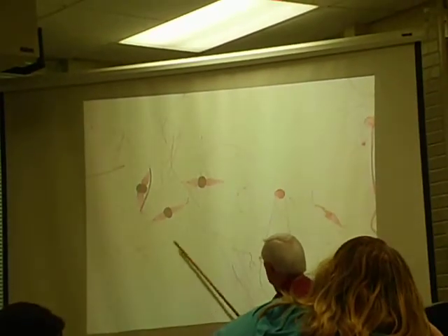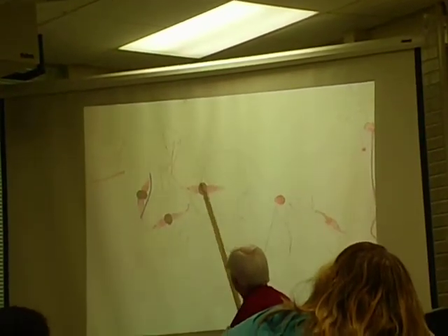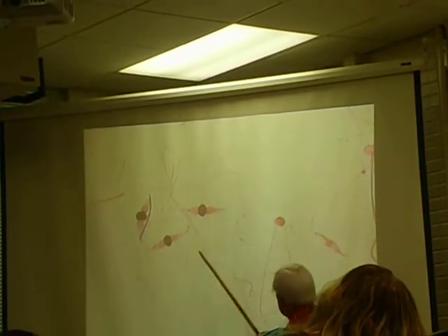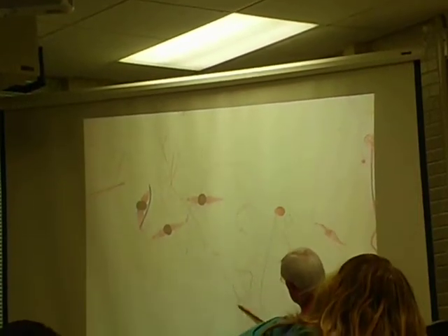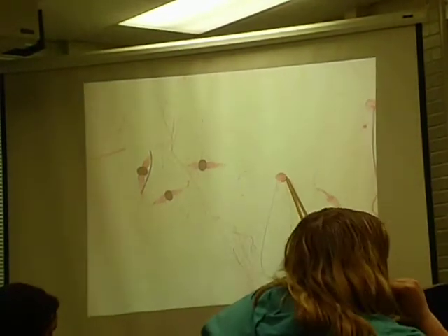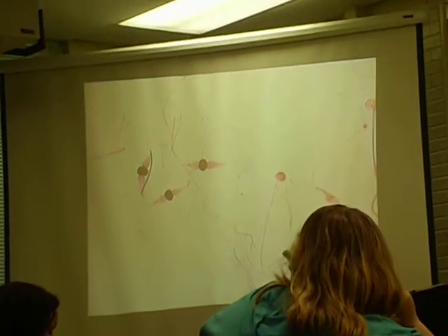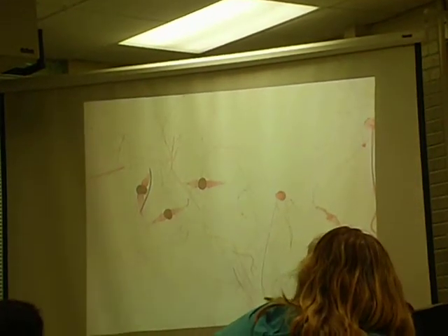Gametangia. Zygospores. Sexual or asexual reproduction? Sexual. What is this entire structure called? Gametangia. What are these little pink hairs? That's hyphae. What is this pink ball? That's the sporangia. What is this structure? Sporangiophore.